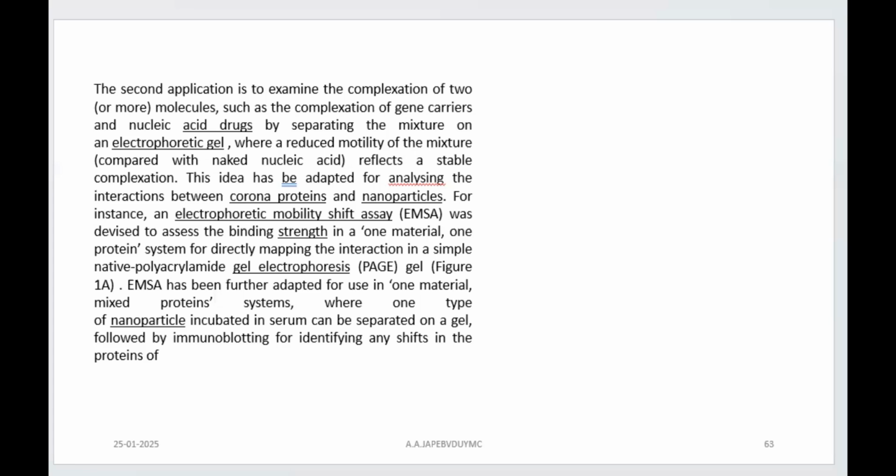You can detect the presence of a particular recombinant protein if you have synthesized it, whether it is getting expressed. So you have extracted the protein and put it on electrophoresis, and you are looking for the presence of the protein in the host plant or host animal, or host cell culture also it could be. So overall, it is a kind of analytical tool, right?